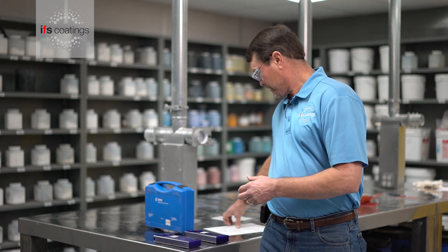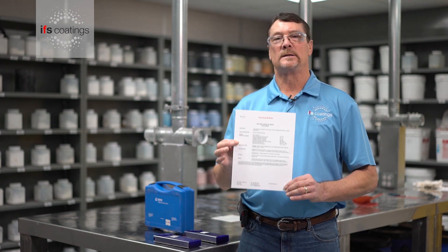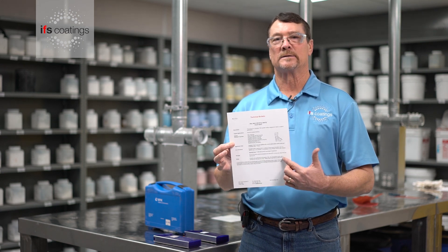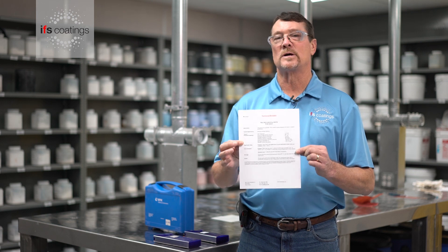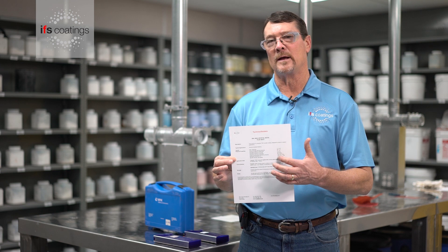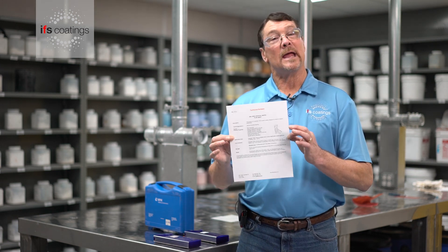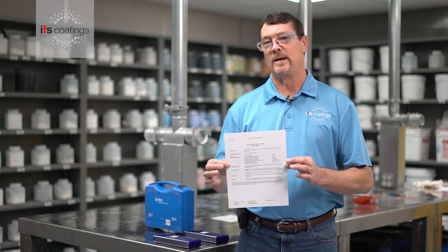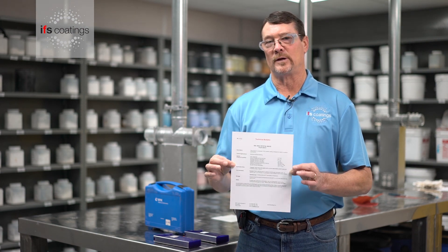When looking at our tech data sheet, it shows what the hardness range is. If the test does fail, you'll want to go back and look at your time and temperature. On this particular product, it's a low cure — 10 minutes at 340 degrees. If it fails and you have a thicker part, you'll want to get it back into the oven and give it a little longer to fully cure.